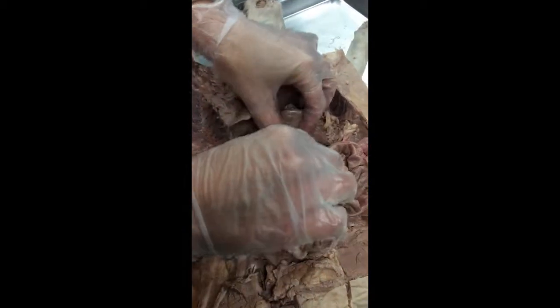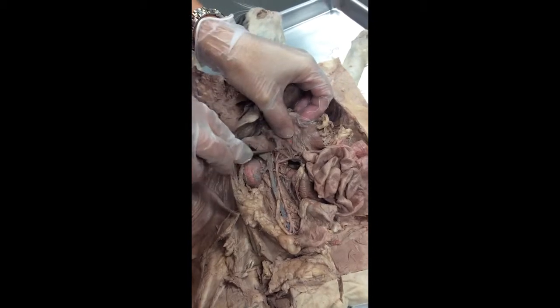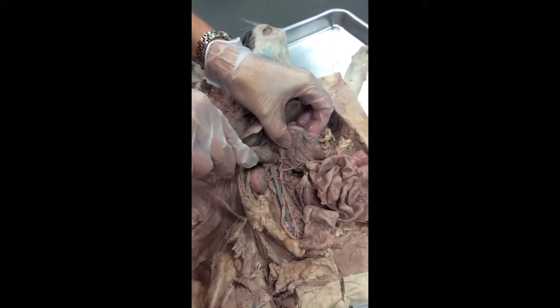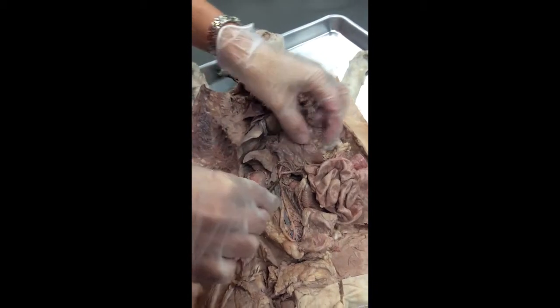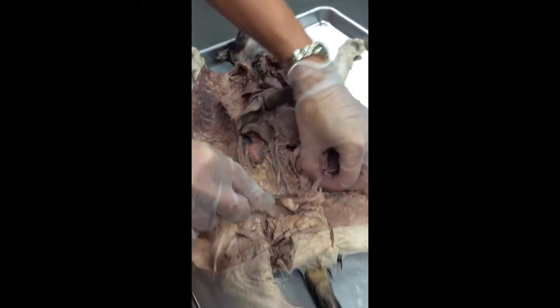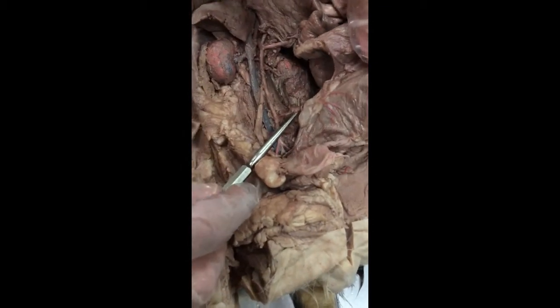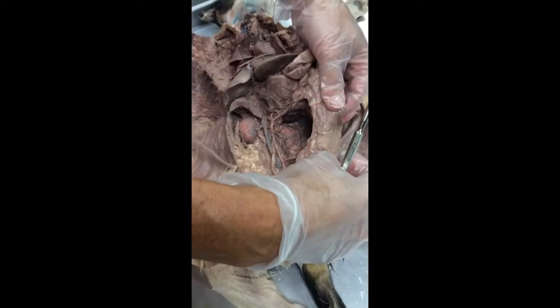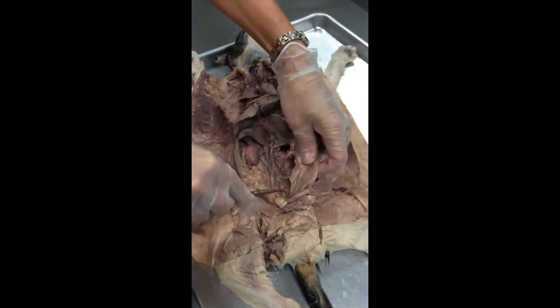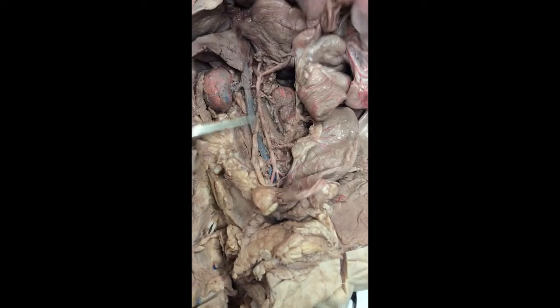And then actually, we'll go to the celiac trunk. The celiac trunk is above it. Okay. So those are two branches really close together. And this you don't see in any other cat. He did it. You could really see it clearly. A lot of times you can't see that at all. And then you go way down. Did you touch yourself on this? That's the inferior. I put gloves on and Kim was helping me. Large intestines. And it's pretty close. You're going to see where it bifurcates. It's close to that. Superior mesenteric.